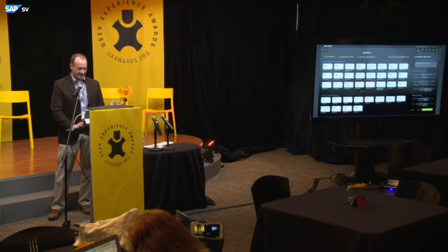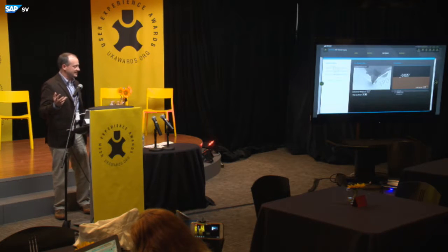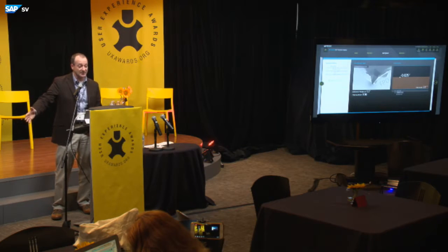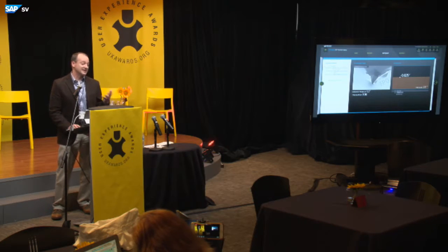let me show you then that card metaphor in action when we separate basic versus advanced functionality. You'll notice big pictures on the right-hand side, detailed settings on the left-hand side. This is a basic view, so I don't have much showing there, because in order to take a basic picture of whatever this little thing is, I don't need to do a lot. But if I do, we use that metaphor for cards, similar to the way, I forget who it was earlier this morning, was talking about the football cards. We were thinking baseball, but that's just us, where you're looking at basic set of information on the front, but if you want to see detailed information, you flip it over.